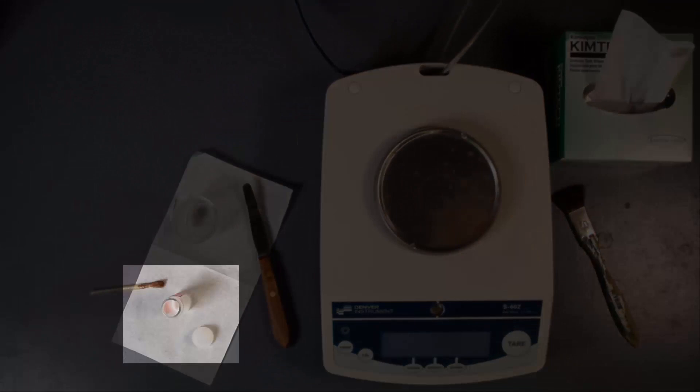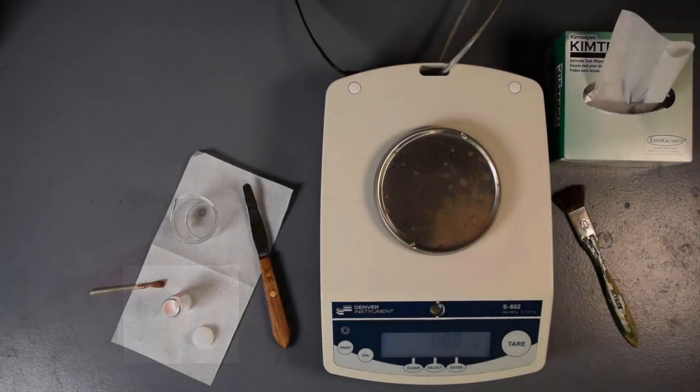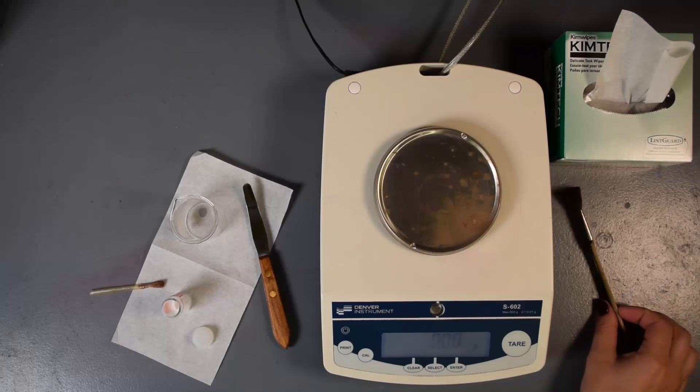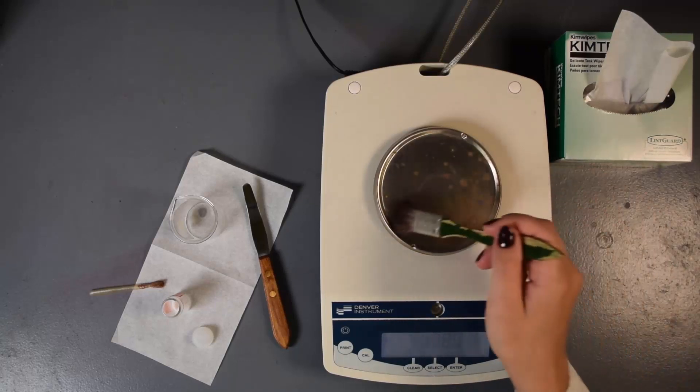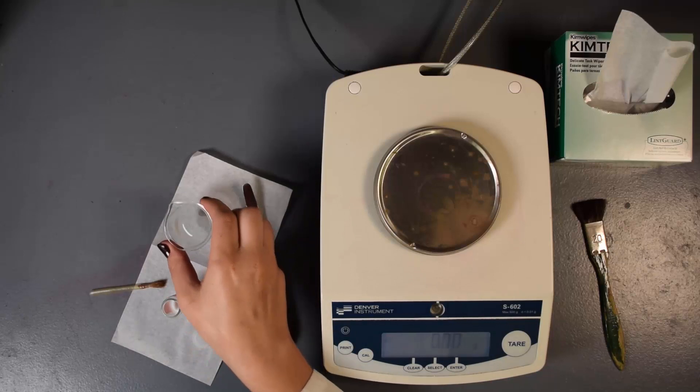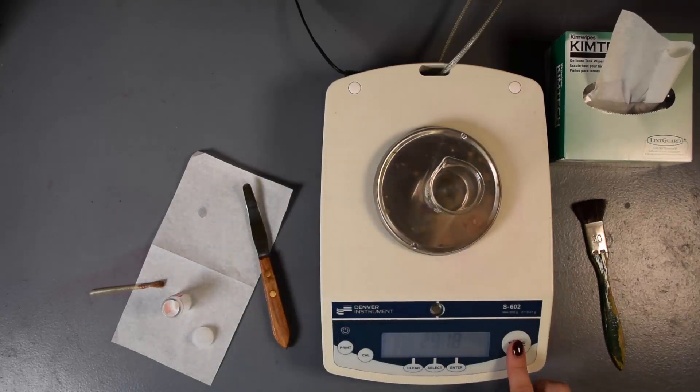It is a good idea to place the container on a kim wipe if the bench top is dirty. If the compound is hygroscopic, the container should be capped as much of the time as possible. Gently clean the balance with a brush. Place the empty beaker on the top loading balance and tare the balance.